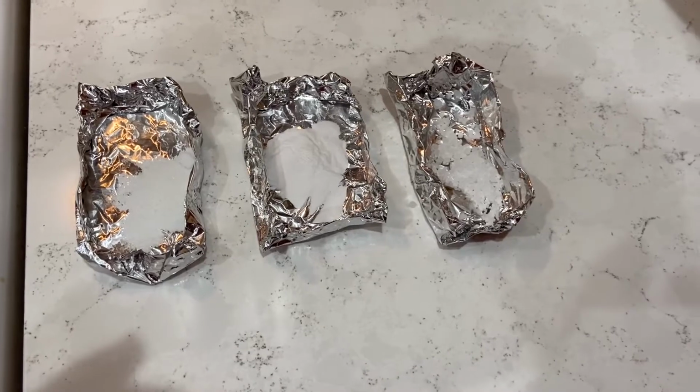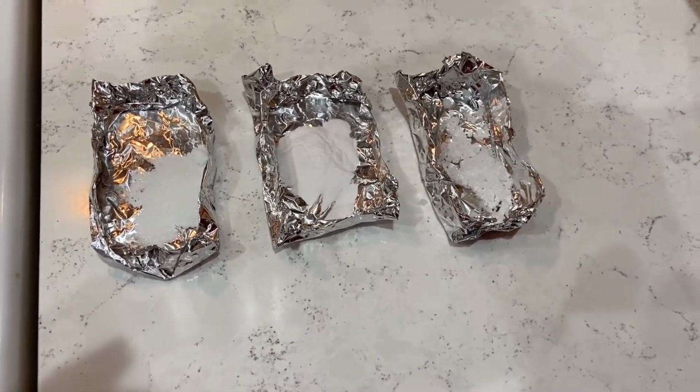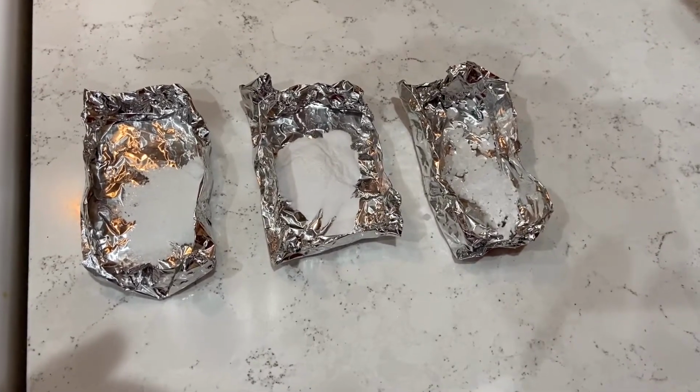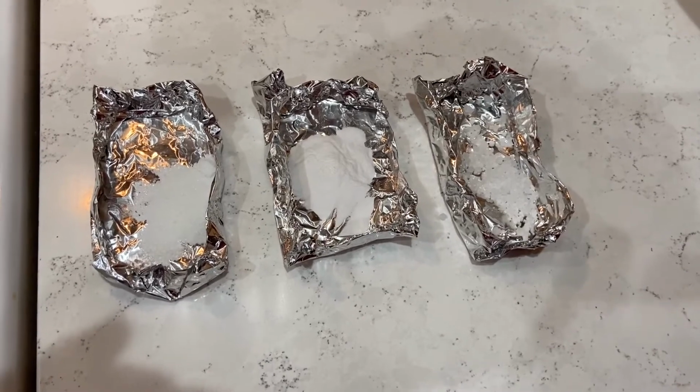Also, you should have already done part one, the modeling section, where you draw some models of molecules of different types. And so now you should be ready for part two on melting point.